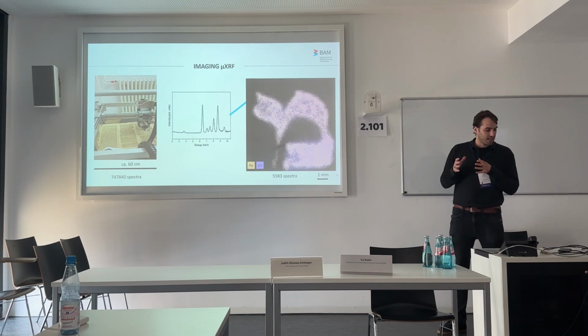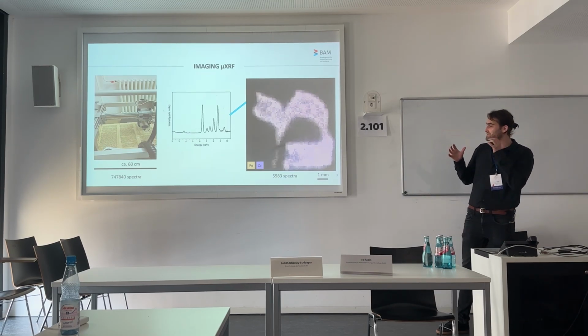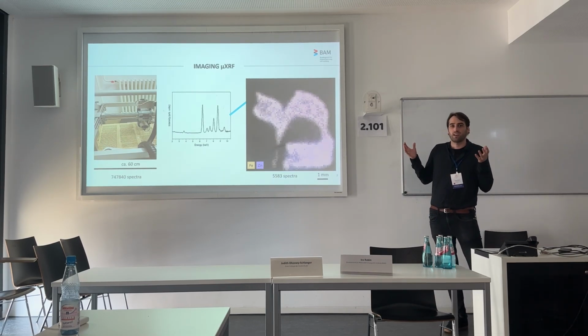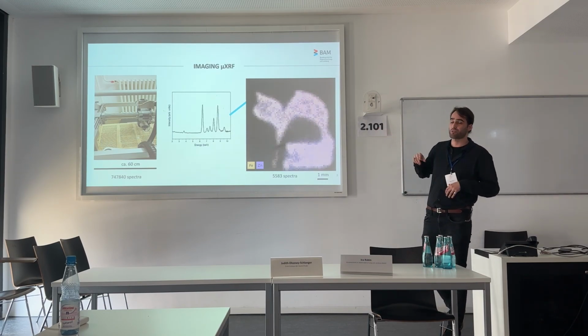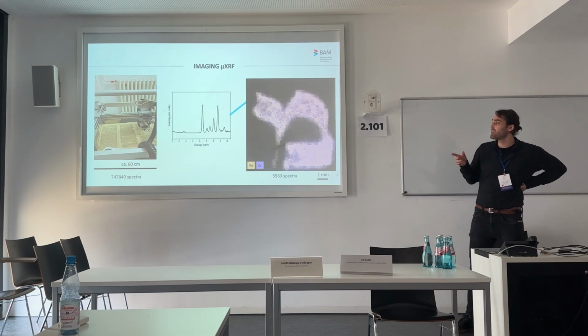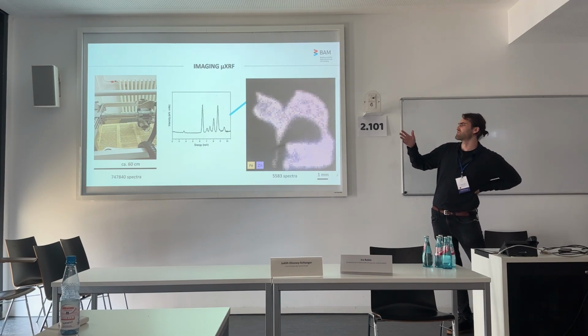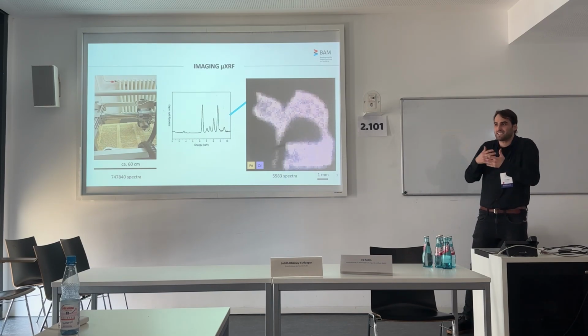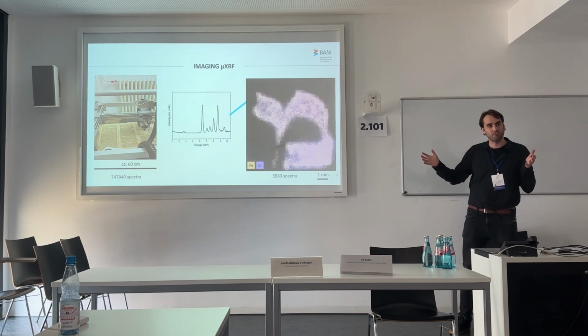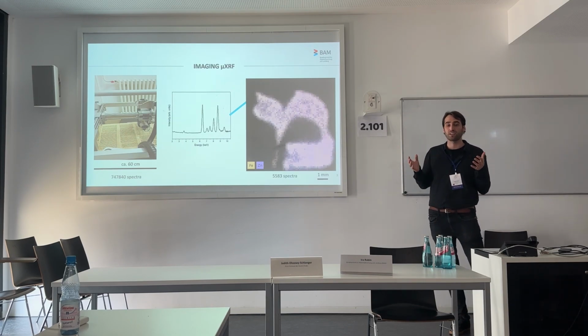Just to give you an idea how much time it takes, it depends on the setup of the equipment. However, for the big scan which I was showing in this little video, we collected close to 750,000 spectra. So it's the points, and each point takes some time to collect. So it can be a couple of hours or dozens of hours, depending on the size of the area.